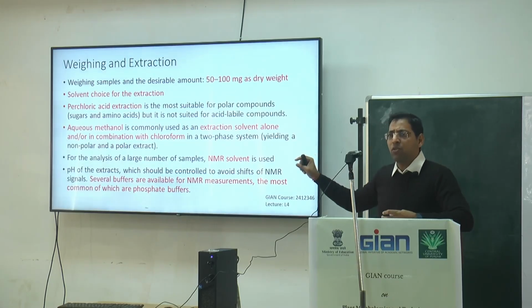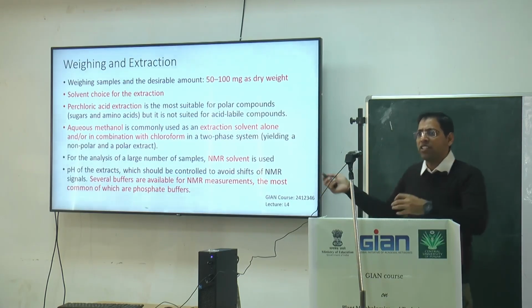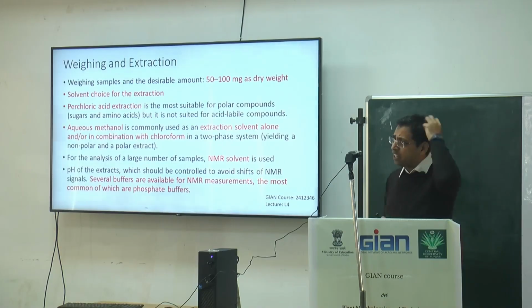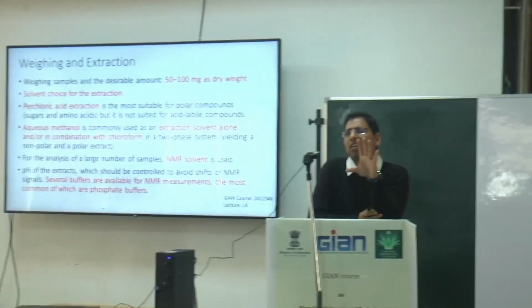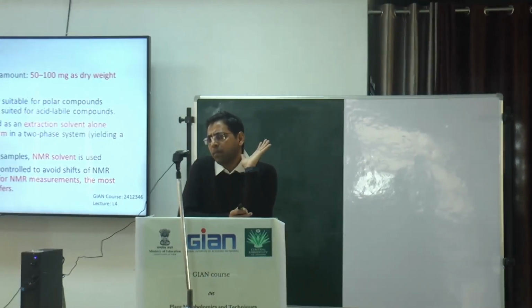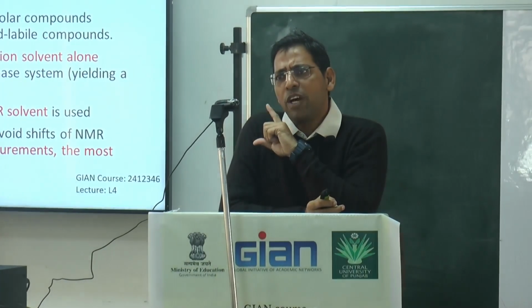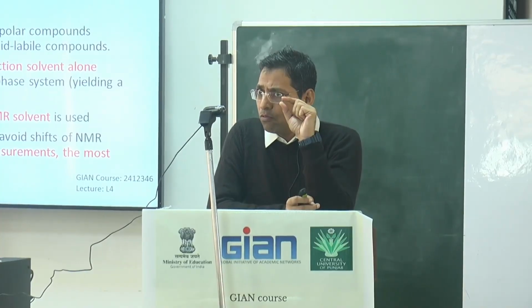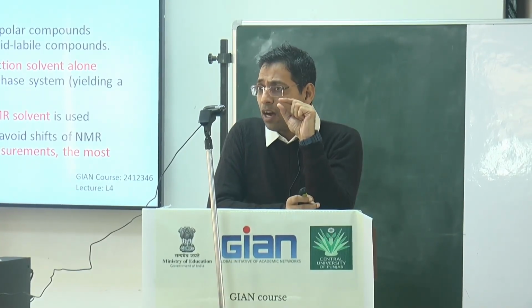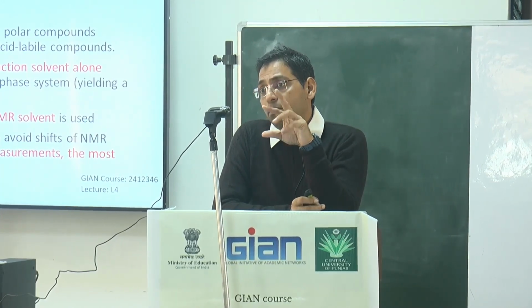I won't explain too much because I thought that Professor Zeng would tell about the extraction protocol, so we skipped that. I just give you the overview of this. Aqueous methanol, you can use the single extraction also, and you can use the double extraction also. In the single extraction, methanol is basically the most important component we are using in the lab. Remember, you don't go ahead if you are working on something highly specific, then you have to select the actual solvents. Otherwise, go ahead with the methanol directly. And remember how much sample you are using, and in how much methanol you dissolve it. This matters. Please take care of this.